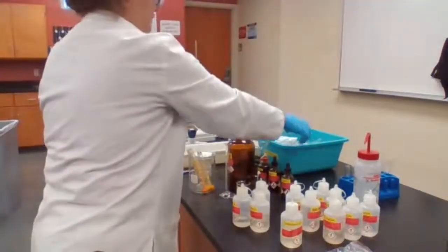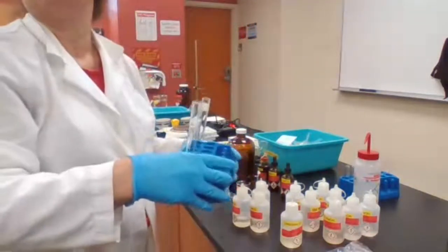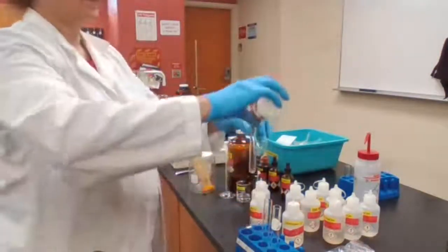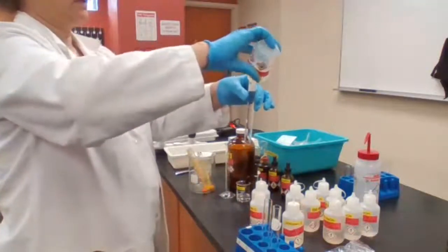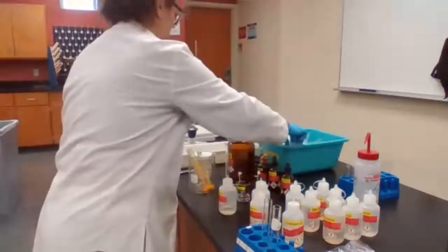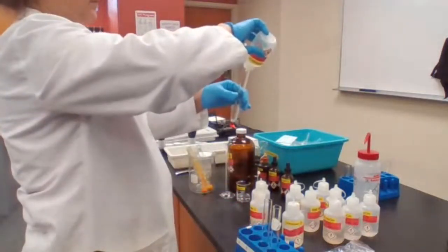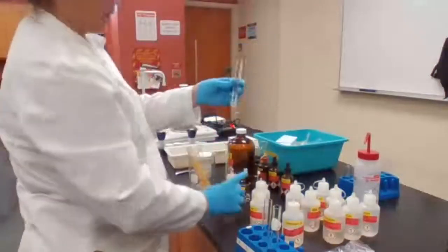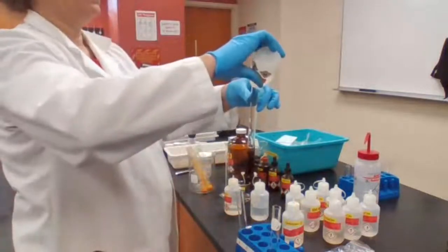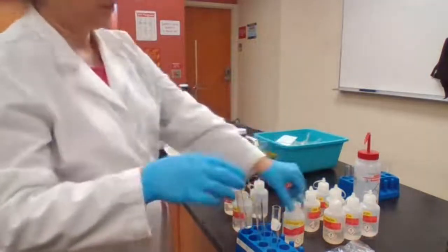I'm going to use A, C, and D only. 5 drops of A, 5 drops of C, and 5 drops of D.